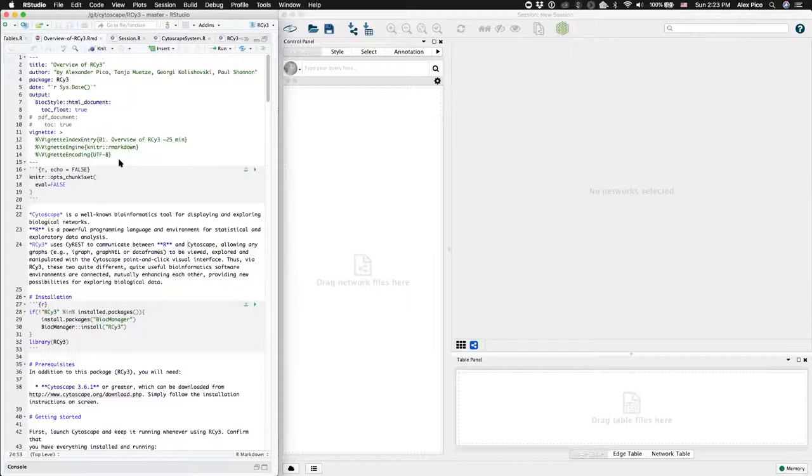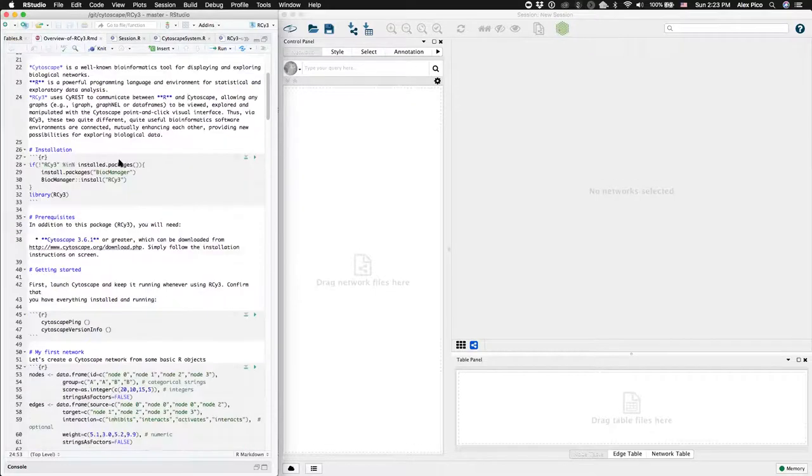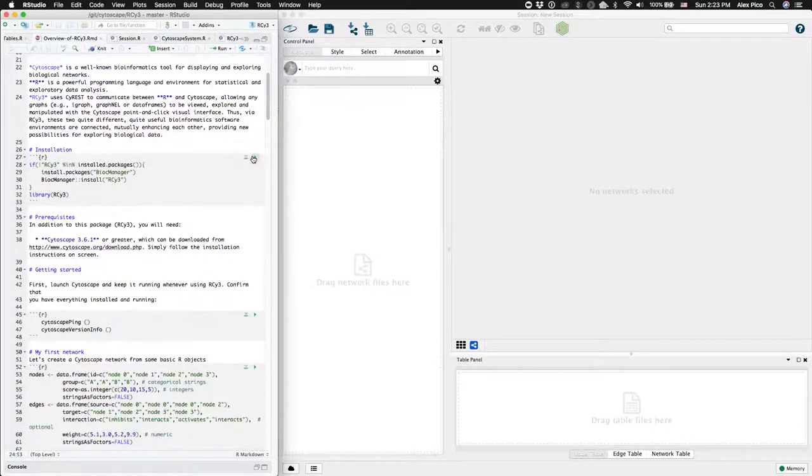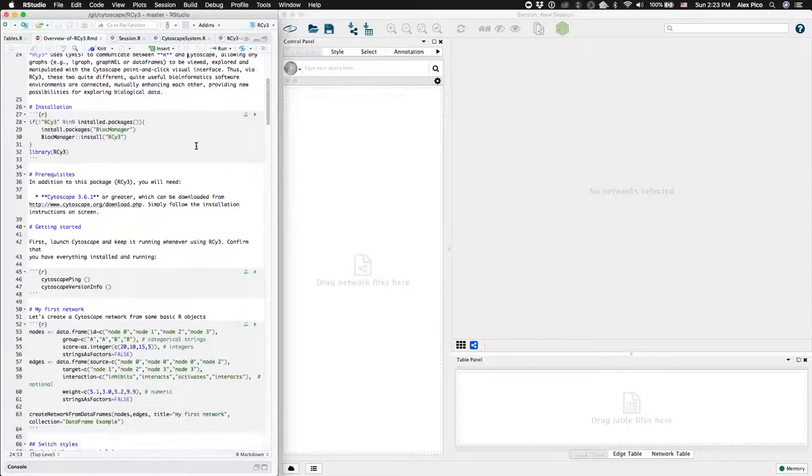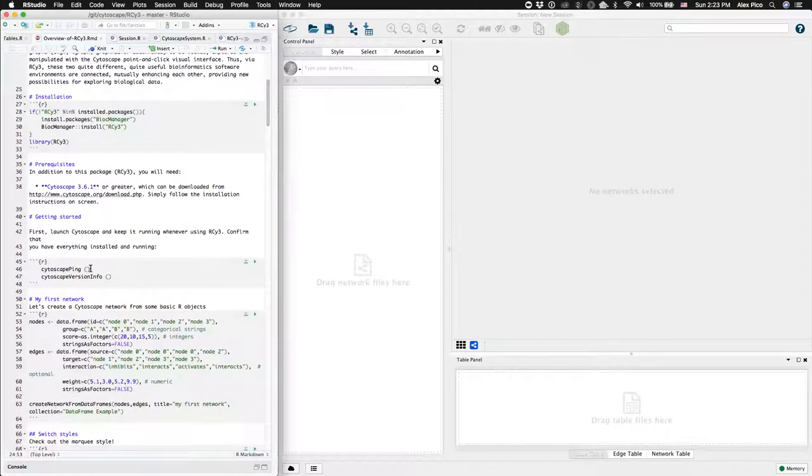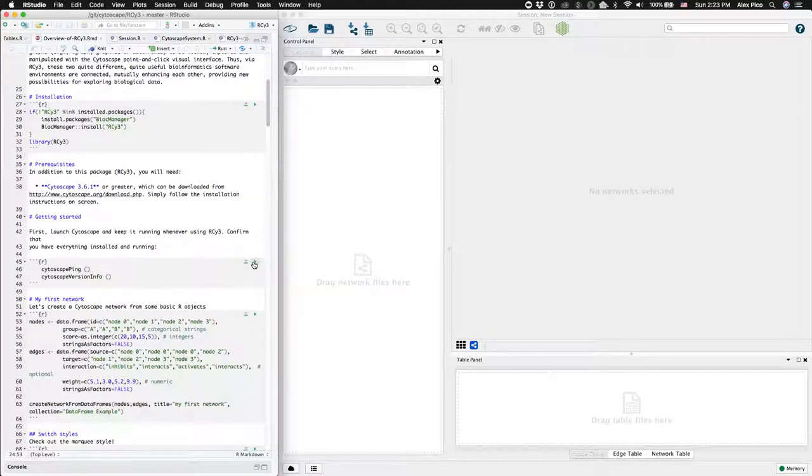The vignette begins with installation, if you haven't already installed RSI3, and then a quick ping to make sure that Cytoscape is up and running.